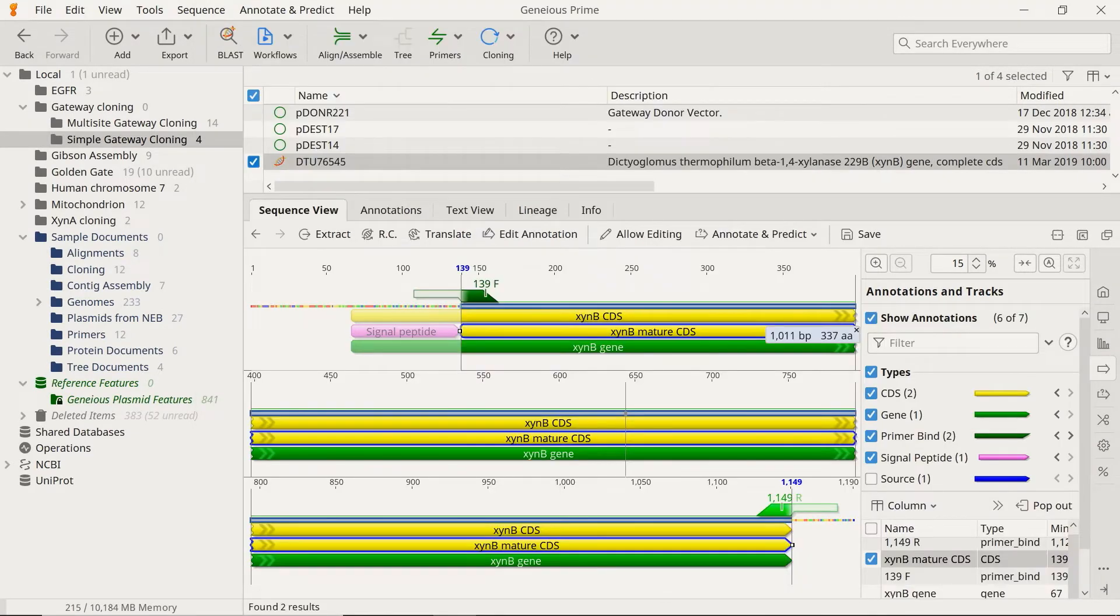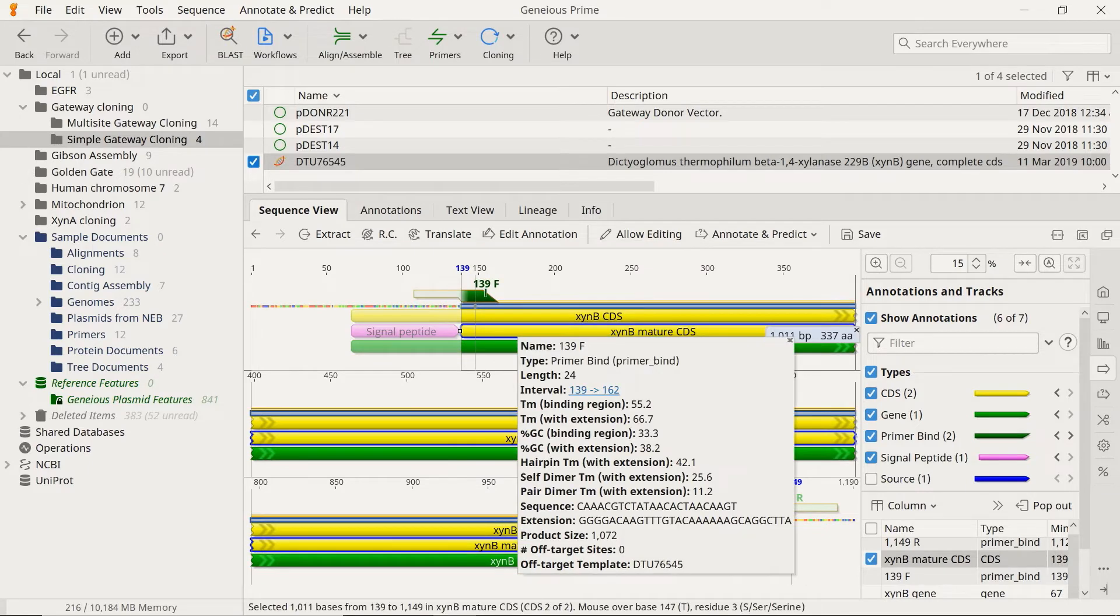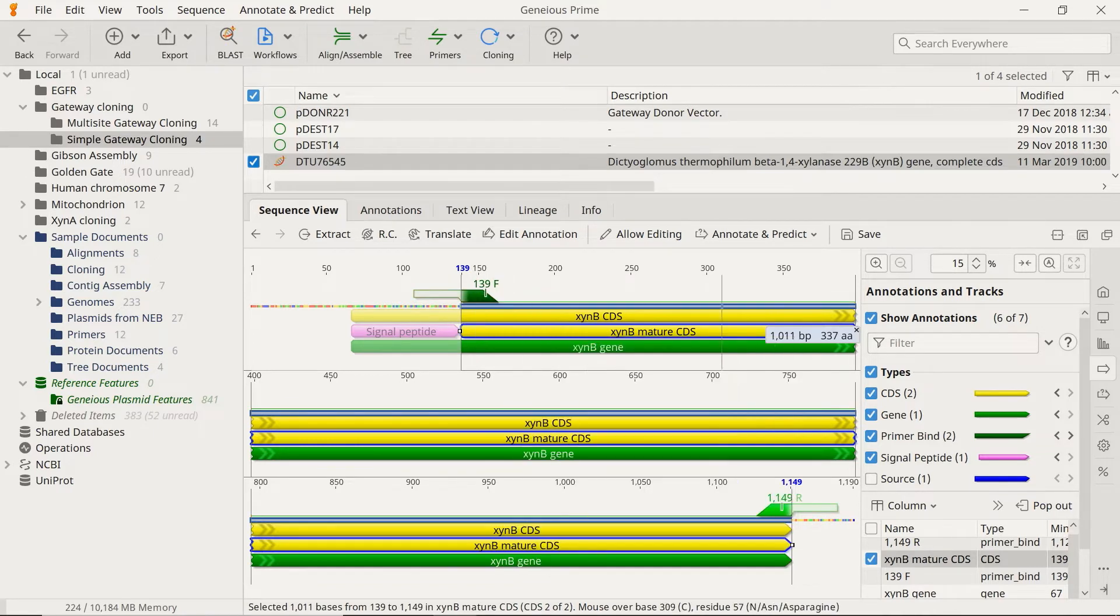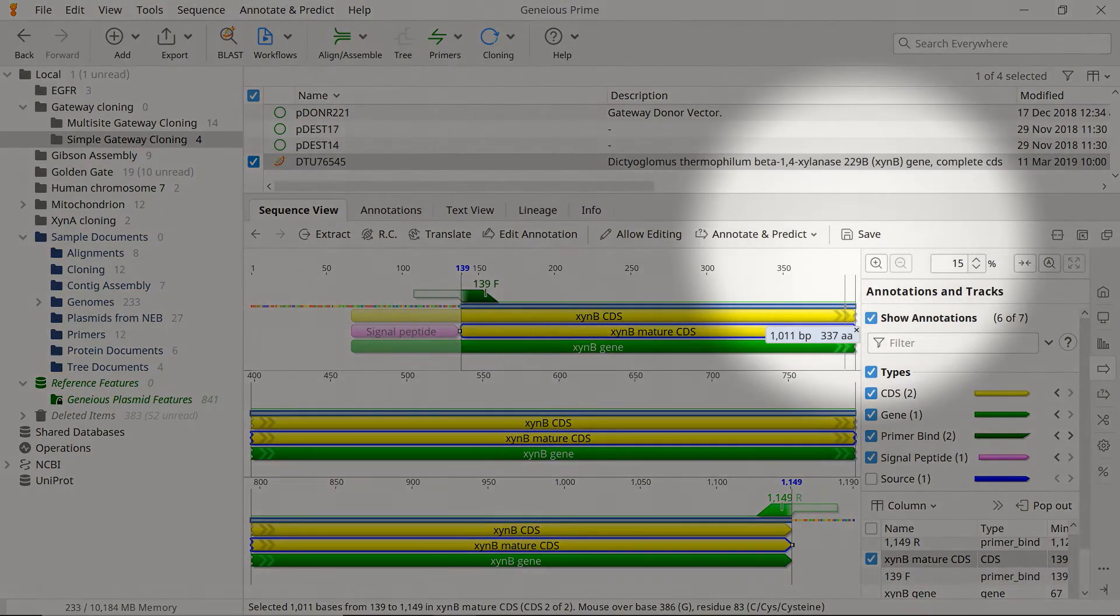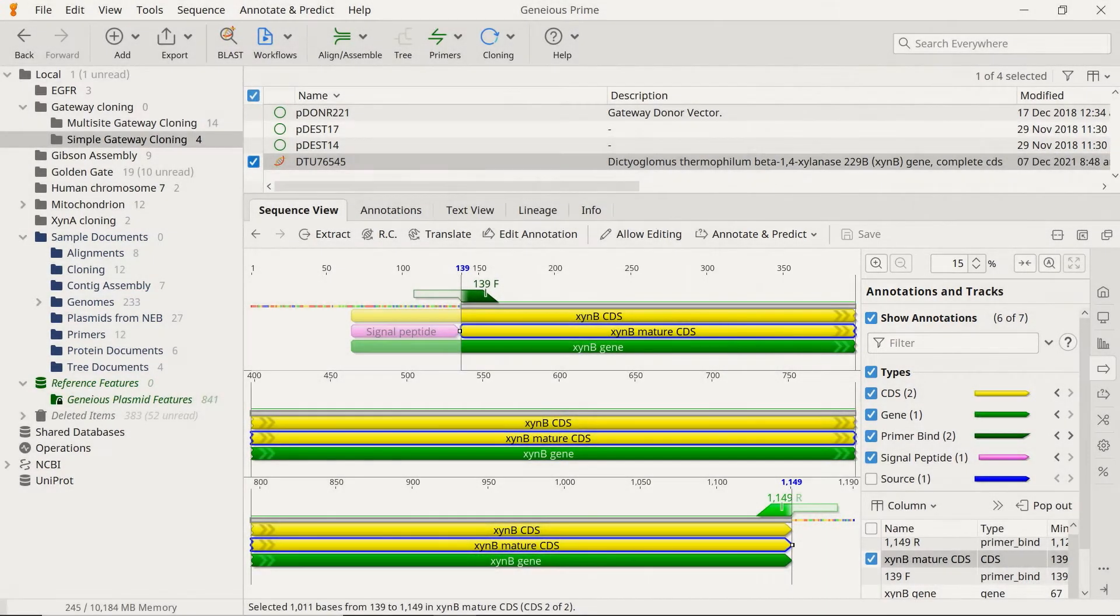You should now see the desired primers added to the sequence. Simply hover over each one to preview their characteristics, such as size, melting temperature, and GC content. Before proceeding, make sure you save your file by selecting Save, or use the keyboard shortcut.